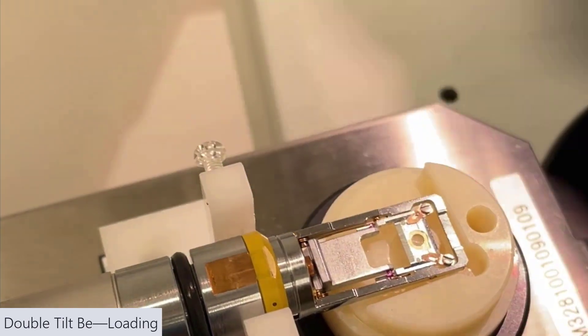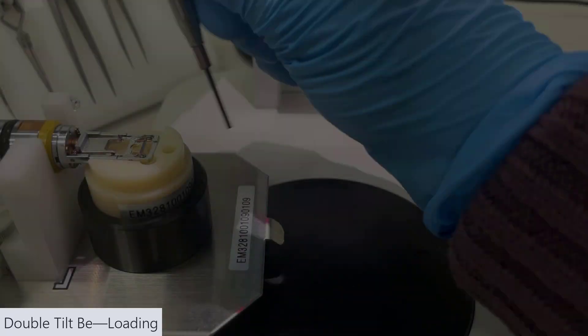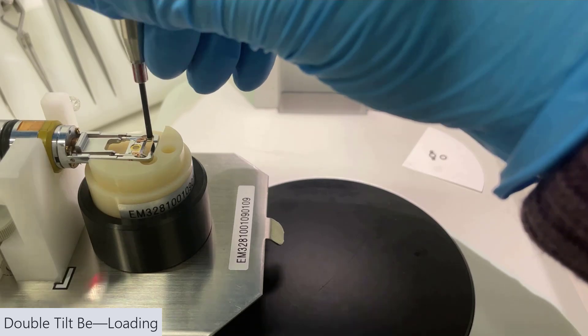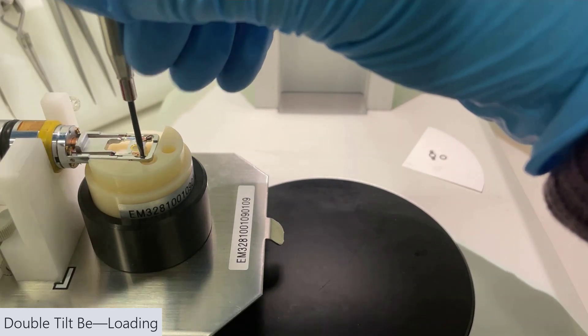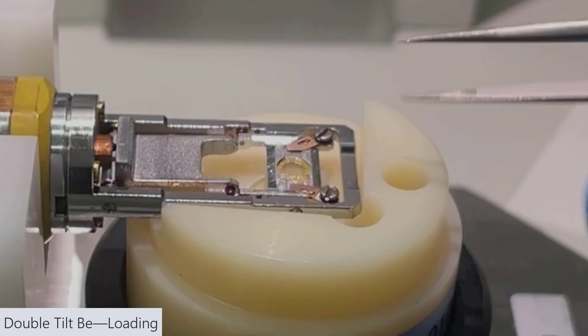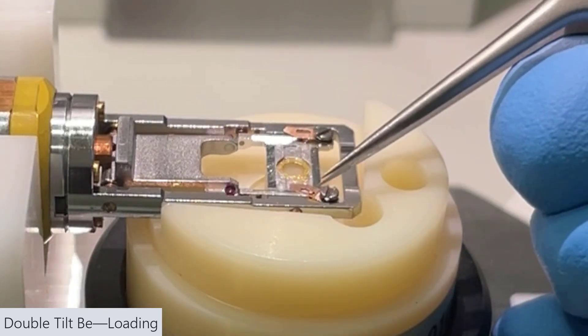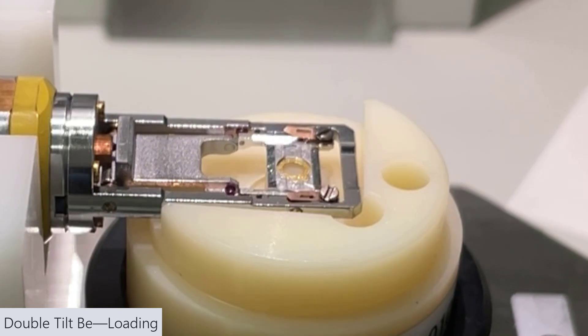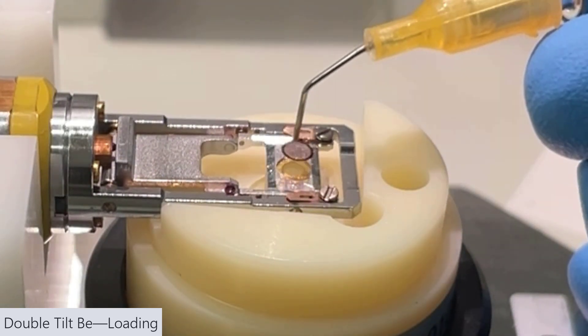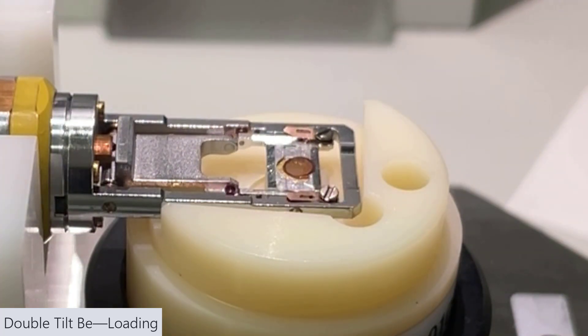This is another double tilt holder, so I'm just locking it in place. Now we have two screws, so you want to loosen both of those a couple of turns and then move them out of the way. Bring your sample in and drop it in place.